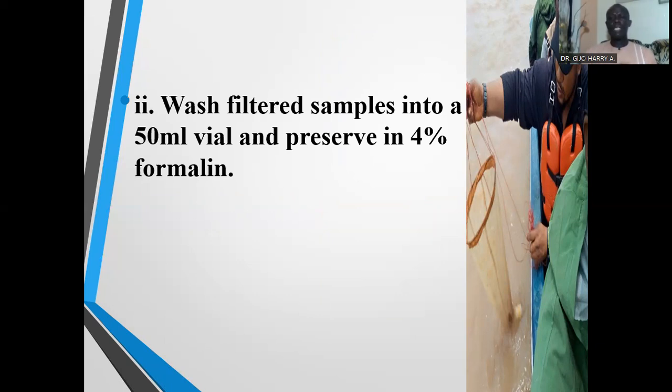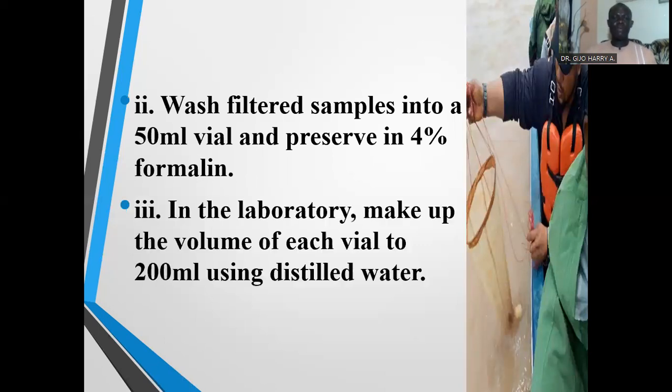In the laboratory, you make up the volume of each vial from 50 mils to 200 mils using distilled water.